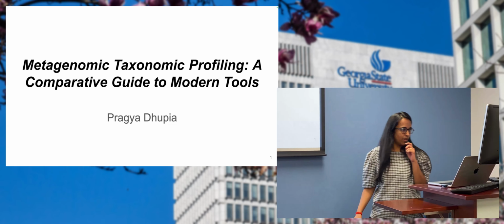Alignment-based is where we align reads to a reference genome. Reference genome, if you know what it is, is the library of reference genomes given by NCBI. Let me explain in this way. Here is the reference genome. We have too many reference genomes, about humans and different viruses, different fungi, and so on. And these are the reads that we have from the environment. From the environment, we have DNA of different microorganisms, which is called reads.